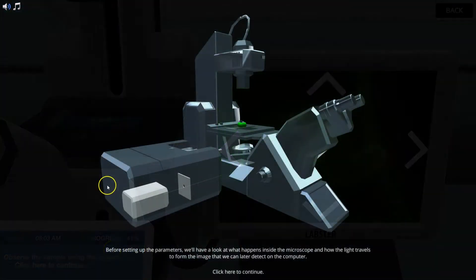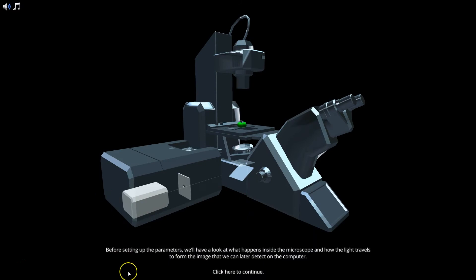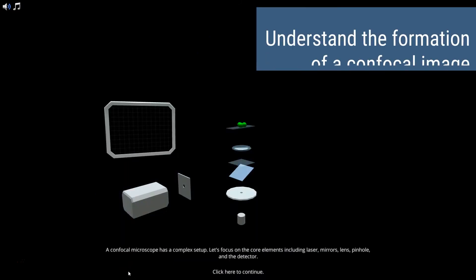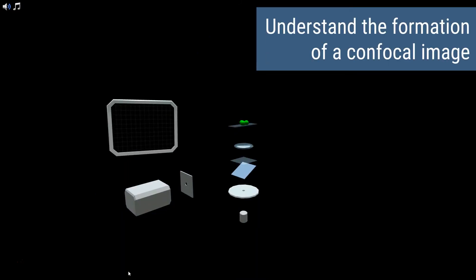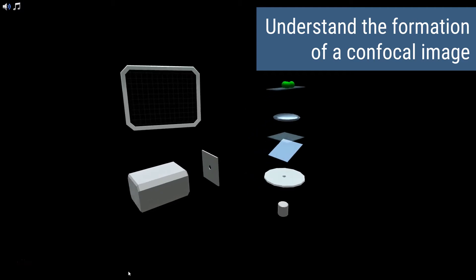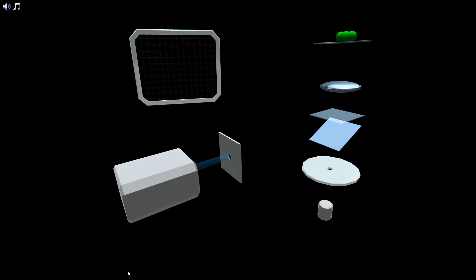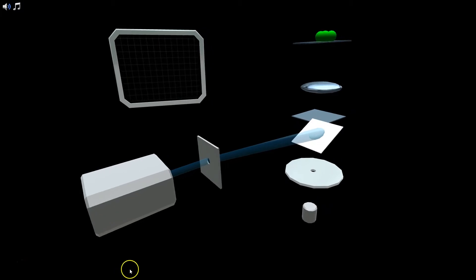Then you will take a peek inside of a confocal microscope and understand how the powerful light of a laser is used to scan a sample in one layer to eventually create amazing 3D images.